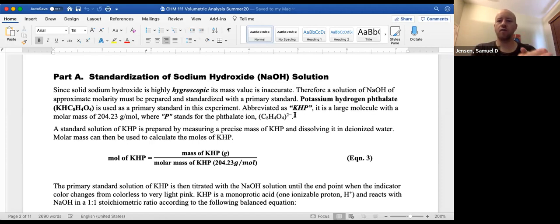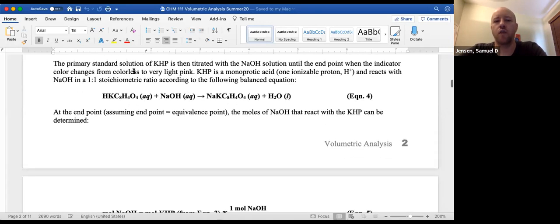And so we know the acid part here because we would have made this using analytical balances and weighed out exactly the amount that we need. And so we know exactly how much of the acid we're putting into our titration setup. And then that helps us to determine its reaction with the base. It interacts via this equation here, which is a standard acid-base equation. We have the acid plus the base makes a salt and water.